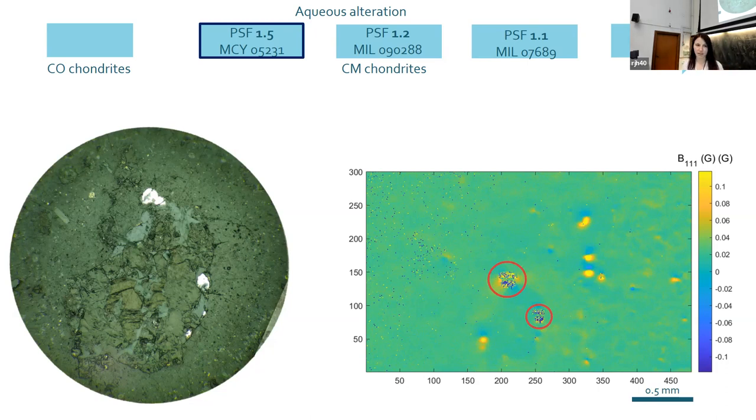The reason I'm interested in this is because these grains have actually started to form magnetite around these cracks. Because this is optical microscopy with reflected light, I can't really zoom in more than this. This could really use an SEM image at some point. But yes, the magnetite starts forming. Right now, we can't really tell whether that has its own field just because of A, the noise, and B, that's a really strong grain and it's drowning out everything else. But it would be interesting to see whether that magnetite has already acquired something or whether it doesn't at all.